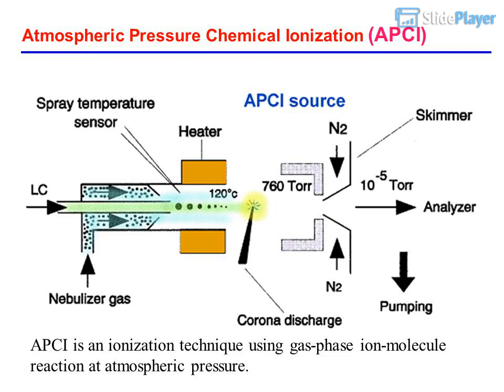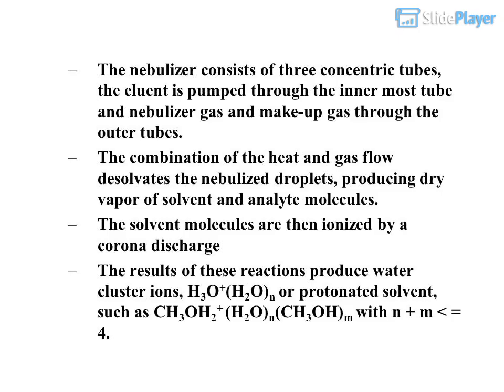Atmospheric Pressure Chemical Ionization, APCI. APCI is an ionization technique using gas phase ion molecule reaction at atmospheric pressure. The nebulizer consists of 3 concentric tubes. The eluent is pumped through the innermost tube, and nebulizer gas and makeup gas through the outer tubes.